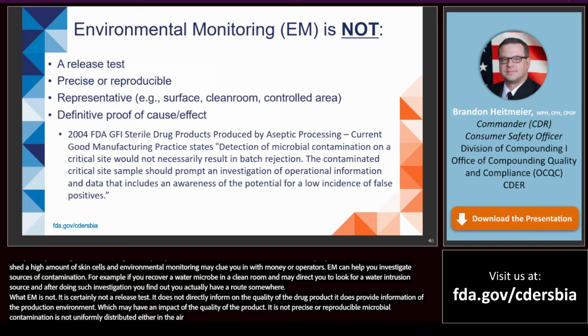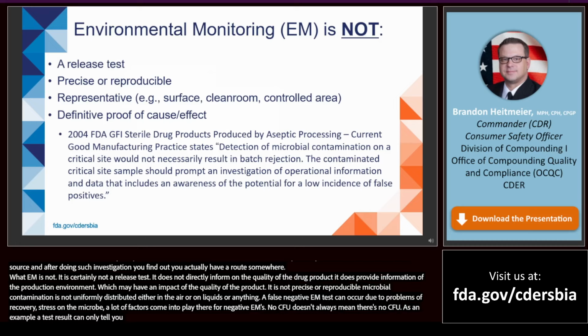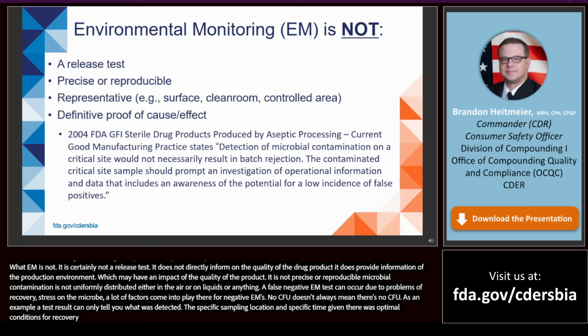Microbial contamination is not uniformly distributed, either in the air or on surfaces or in liquids. A false negative EM test can occur due to problems of recovery, stress on the microbe. A lot of different factors come into play there for a negative EM. So, no CFUs doesn't always actually mean there is no CFUs. A single EM sample and test result can only tell you what was detected at the specific sampling location at the specific time, given there were optimal conditions for recovery, is what was actually viable there at that time and location.